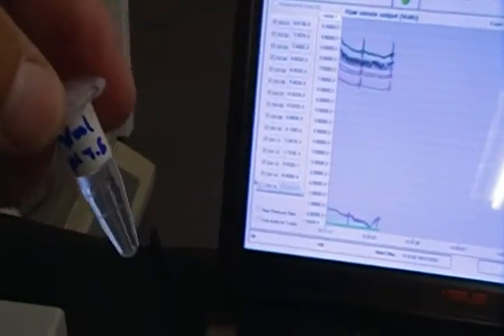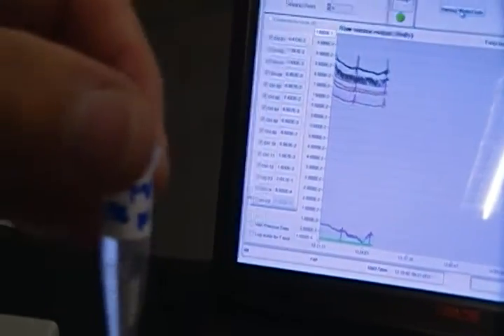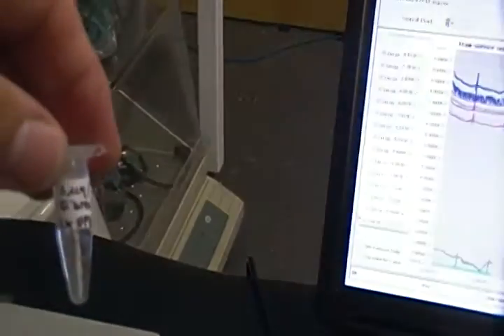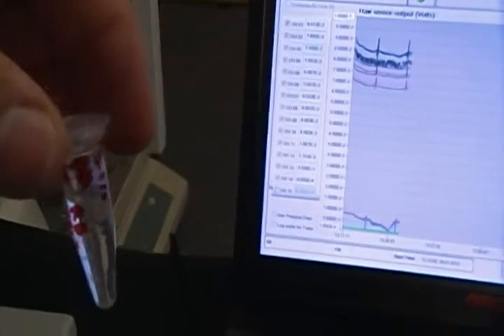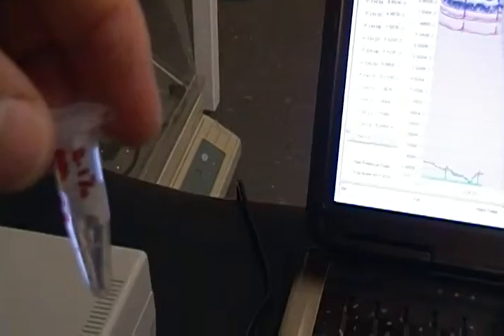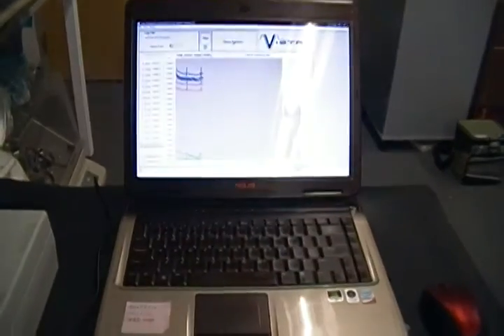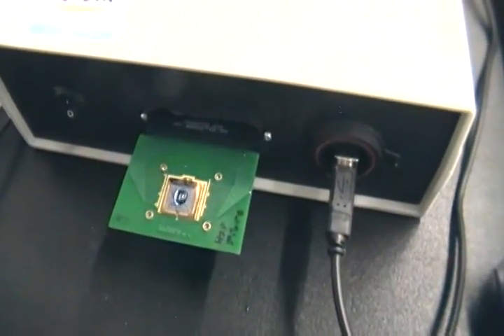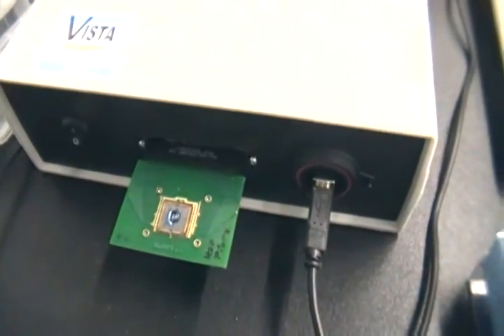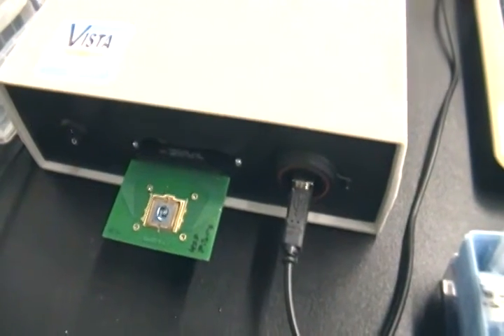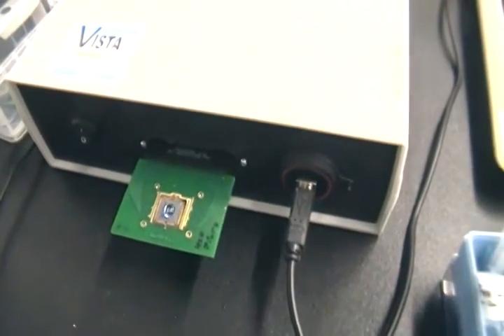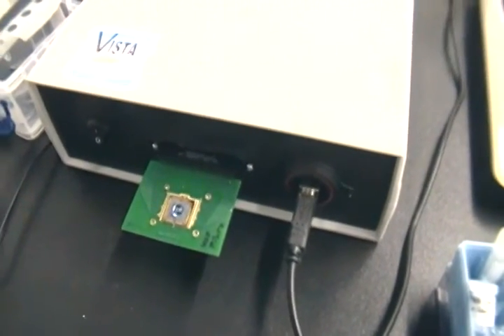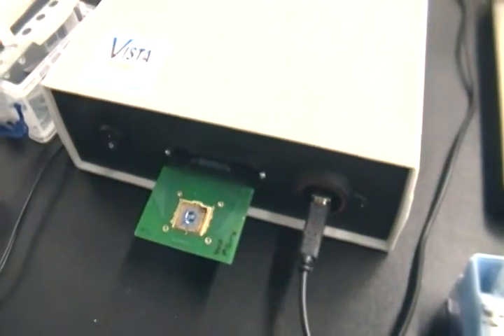So the next thing we're going to do is we're going to actually add known concentrations of the target molecules. We have heat shock protein here and fibronectin in very low concentration. And then as a control, we have 0.1% human serum albumin. It'll take me a moment to get these ready to go, but we'll come back and we'll catch up when I'm ready to pipette these. You can see this is the very simple system. If someone simply connects the nanobiosensor to a laptop or a desktop, the software automatically runs the program. One inserts the card of interest and these cards, we send them out so that the customer can functionalize these cards themselves, that is, attach whatever capture molecule interests them, whether it be an antibody or an aptamer.